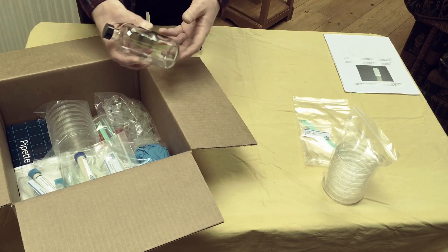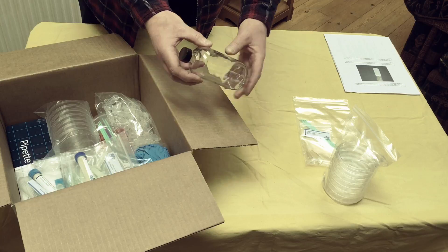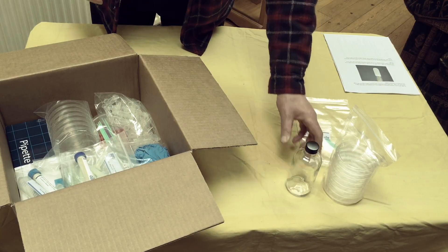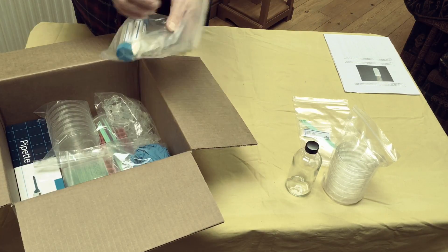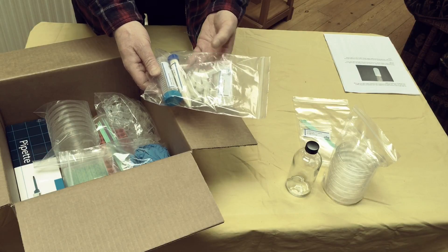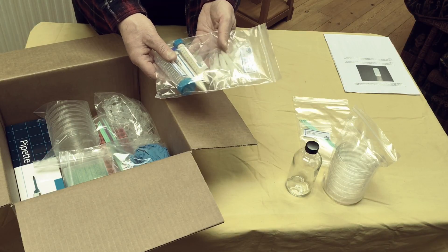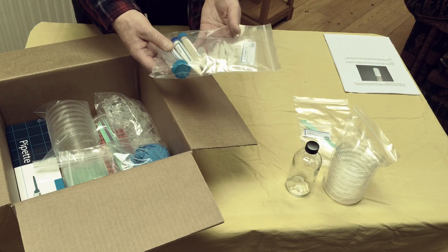There's a glass bottle here. And what have we got? These seem to be some kind of test tubes, tube for measuring, it says.